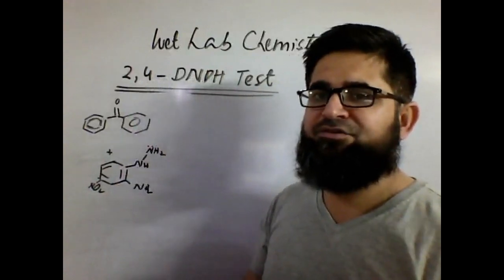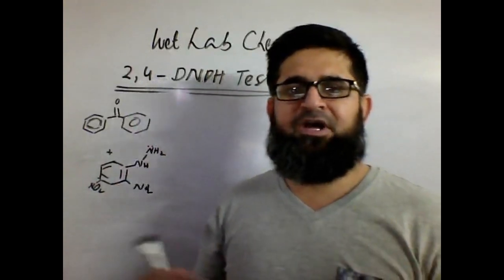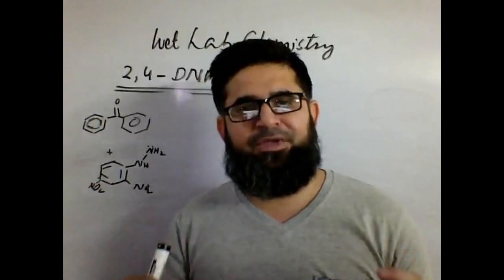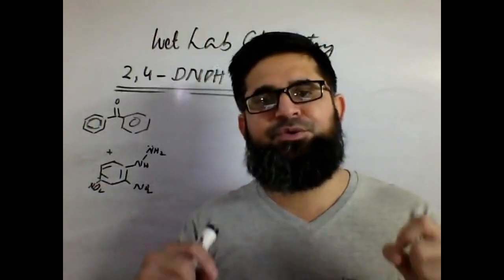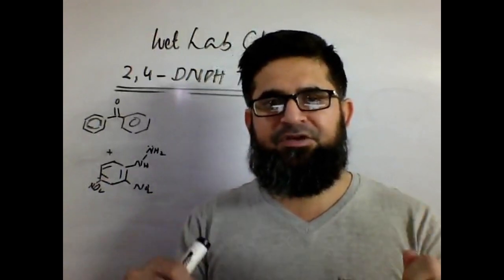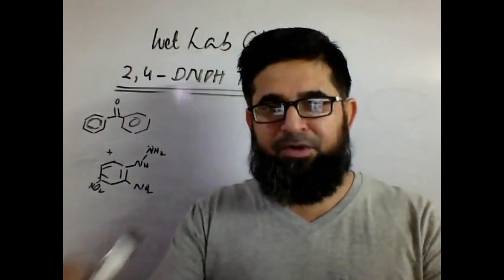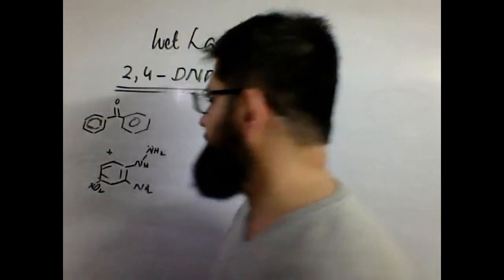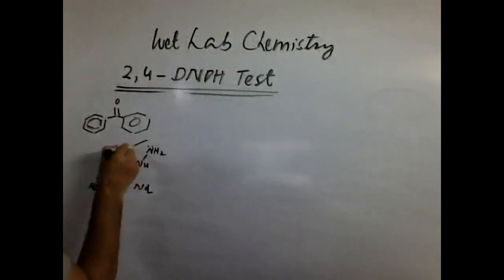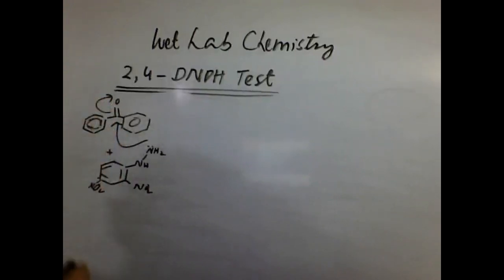And I have just explained the mechanism, what is the exact chemical reaction that happens inside the test tube that helps you to identify the given unknown carbonyl compound.